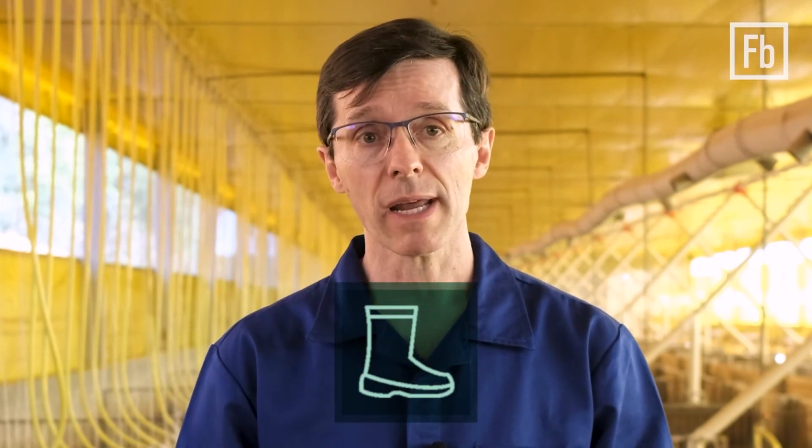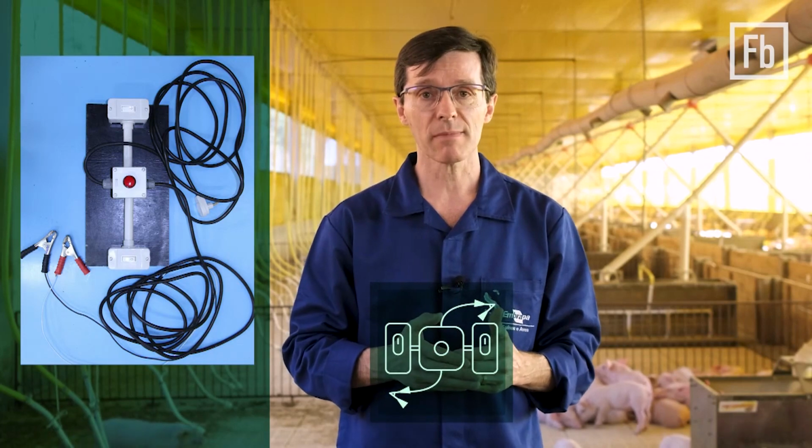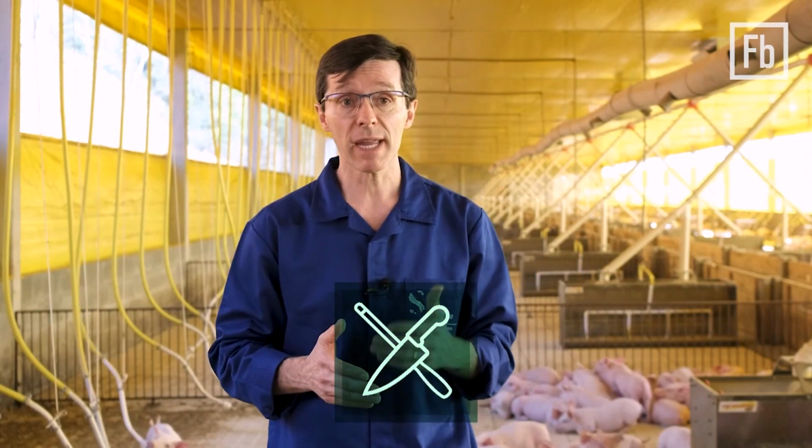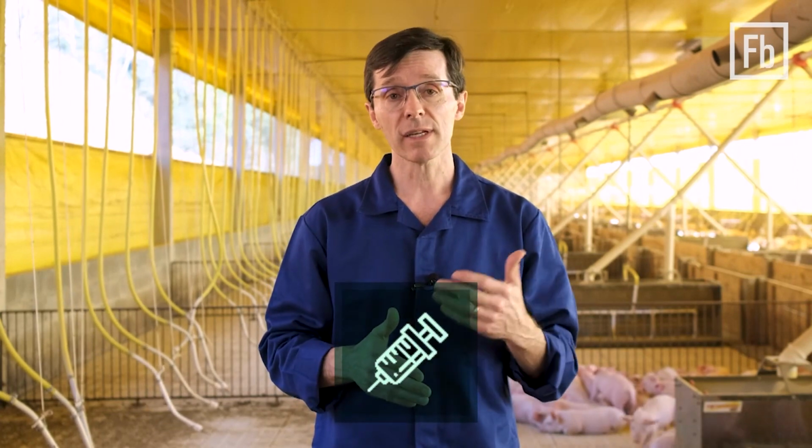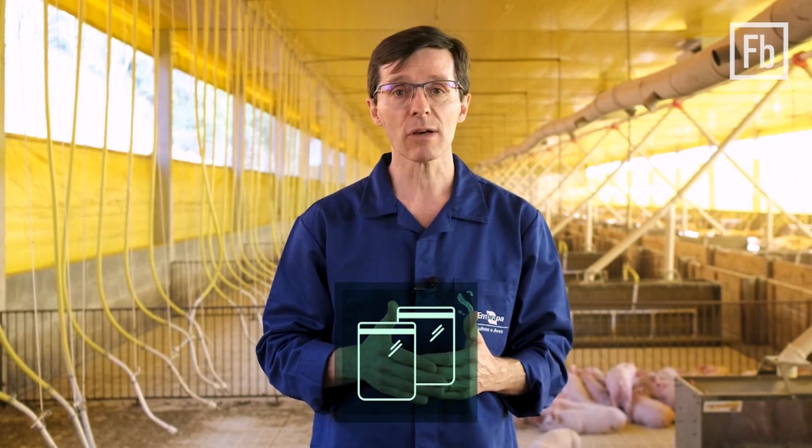For a proper complete necropsy, including the collection of samples for laboratory tests, necessary materials include autopsy gloves, lab coat and boots for the veterinarian's protection, equipment for stunning the animals, knife and honing steel, bearing in mind that a good, well-sharpened knife greatly assists the necropsy, surgical scissors and forceps, a source of flame, which can be a Bunsen burner or a cotton ball soaked in 70% alcohol for the disinfection of the instruments, a saw for opening the cranial box and cutting other bones, sterile syringes and needles, swabs, and new plastic bags for packaging samples for microbiological analysis, wide-mouthed vials, and 10% formalin, preferably buffered, for sample fixation for histopathological and immunohistochemical tests. Buffered formalin is usually provided by the laboratory.